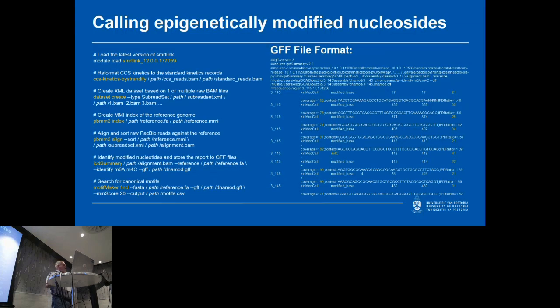So what do we need as input files? We need basically 2 files: a GFF file with modified nucleotides, and a GBK file, which is the annotated genome sequence. Where can we get these files? We suggest using third-generation sequencing facilities like PacBio, which creates long reads and stores all information about kinetics of base calling.